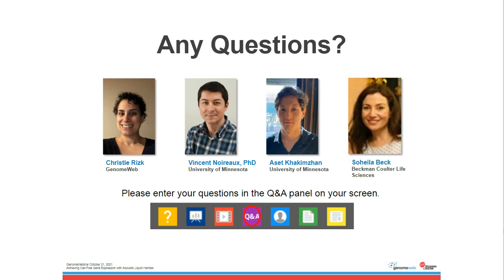Forgive me, folks, I was on mute. Let's go with our first question for both Vincent and Aset. Vincent, maybe you want to take this one first. How does the liquid not fall down while it's inverted in the destination stage?